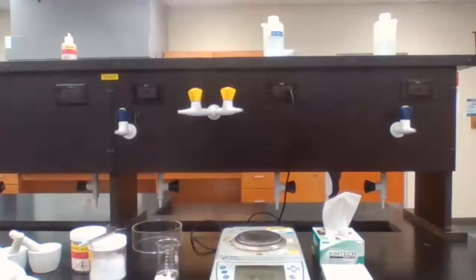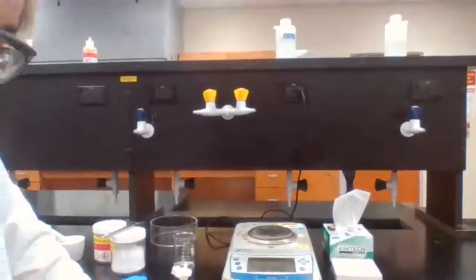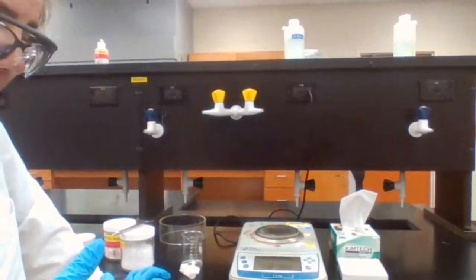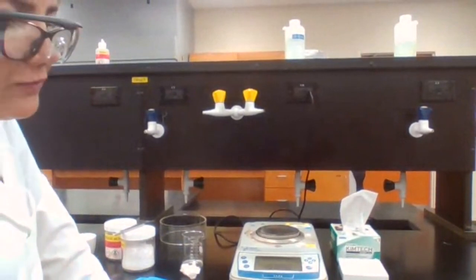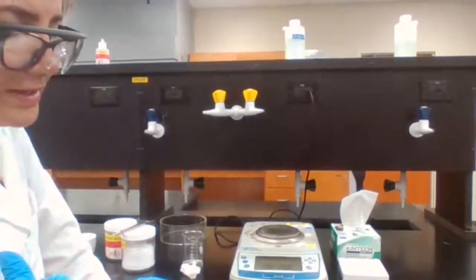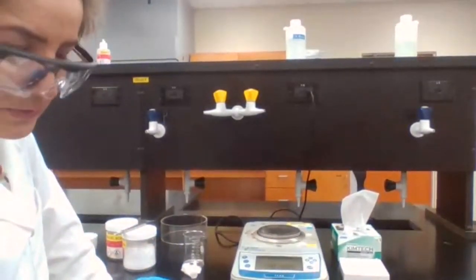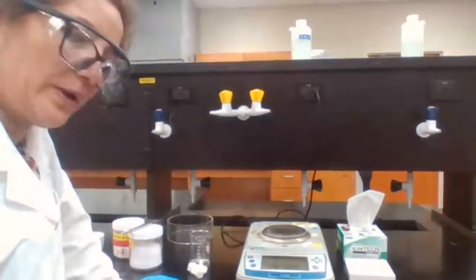Professor, when will we do the hot water bath? I didn't notice if we did that yet. We didn't. We had a choice of using hot water bath or hot plate low temperature. I used the hot plate and I put it directly on the hot plate. So we didn't use the hot water bath. Okay, thank you. Those are two choices you could use. Because it's ether, you should never use direct flame. You should not use an open flame because this ether is flammable. And for gentle heating, you can set up your hot plate at a very low temperature, like I did between 3 and 4, or you can use a hot water bath, either one.